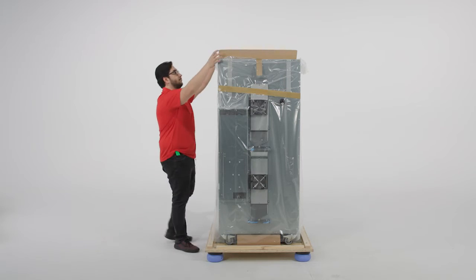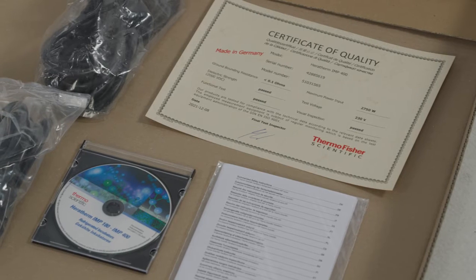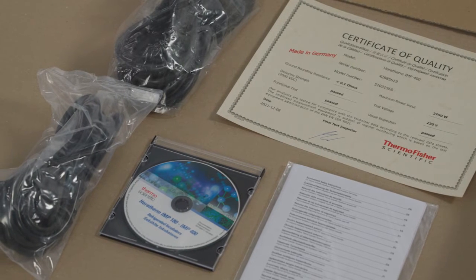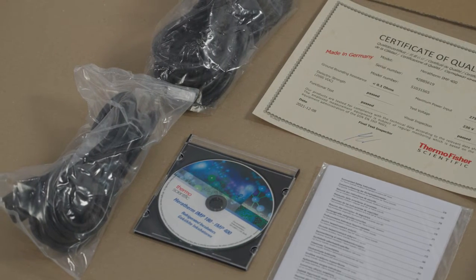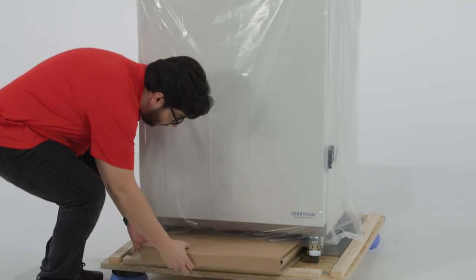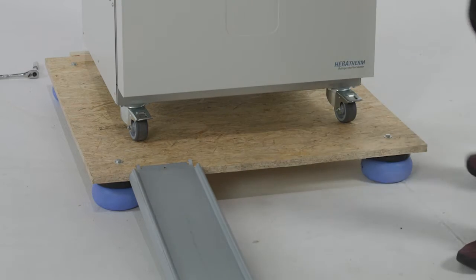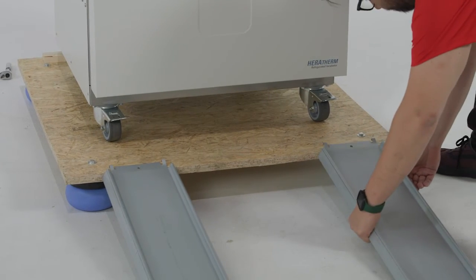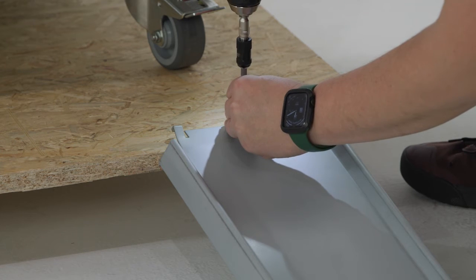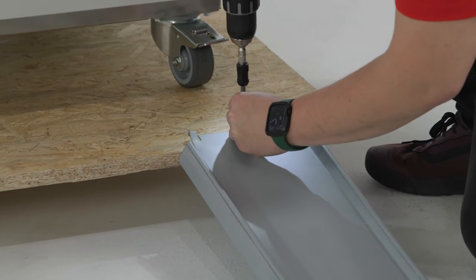The accessories are packaged in a separate box on top of the unit. The accessories for the unit will include a power cord, an electronic copy of the user's manual, and a certificate of quality. Once the accessory box has been cataloged, remove the box beneath the unit. This box contains the rails needed to remove the floor-standing model from the pallet. If you purchased a benchtop Thermo Scientific Heratherm IMP180 refrigerated incubator, you will not receive rails for removal.